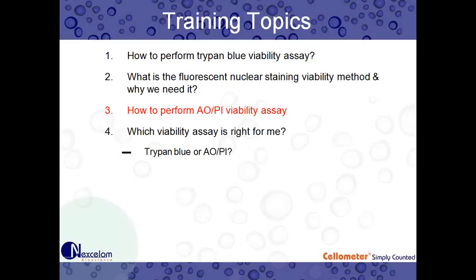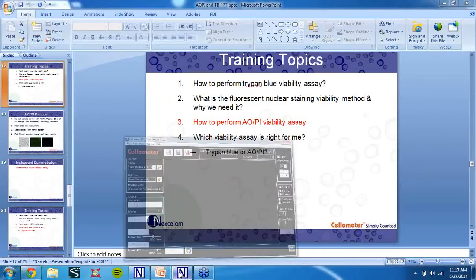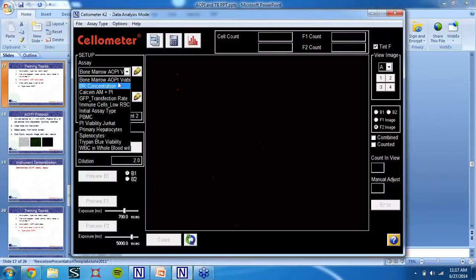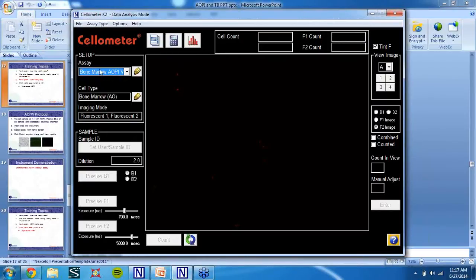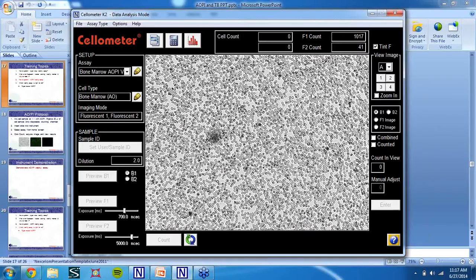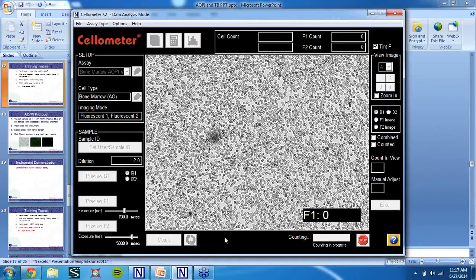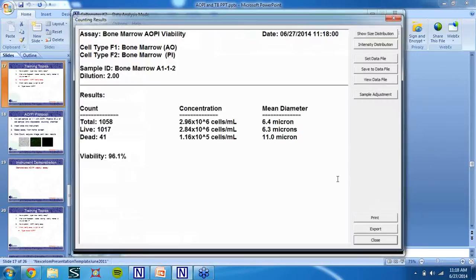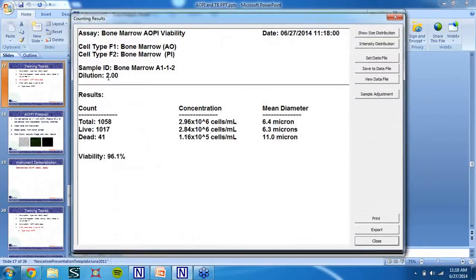Now we're going to go over performing the AOPI viability assay on our Cellometer K2 software. We're counting a fresh bone marrow sample for AOPI viability — I select that assay from the drop-down menu. The image is already loaded. Zooming in, it looks similar to the image I showed earlier with lots of cells. I'll count this now — despite the very high cell number, the software analyzes for viability and concentration in about 15 seconds. Results are displayed: total live and dead counts, concentration, average diameter, and viability percentage.